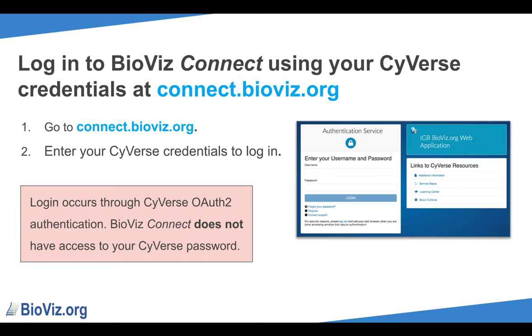Now that you have downloaded and installed IGB, as well as created your CyVerse account, we are ready to explore BioViz Connect. First, you will need to log in to BioViz Connect by going to connect.bioviz.org. Use your CyVerse username and password to log in. Note that authentication is handled through the CyVerse OAuth 2 authentication service. This acts as a single sign-on, similar to how you can sign in to multiple sites using your Google or Facebook credentials.